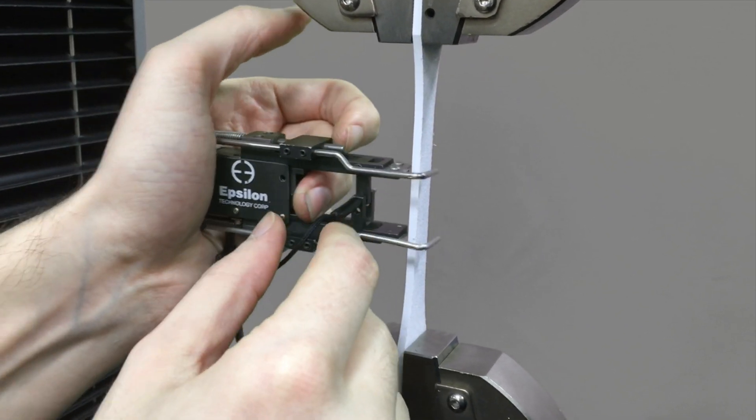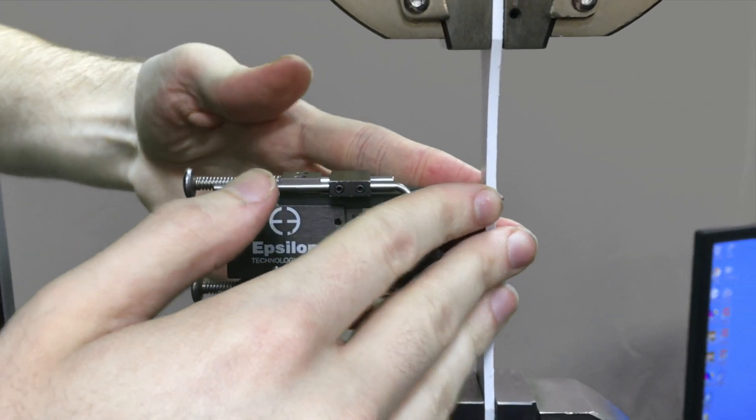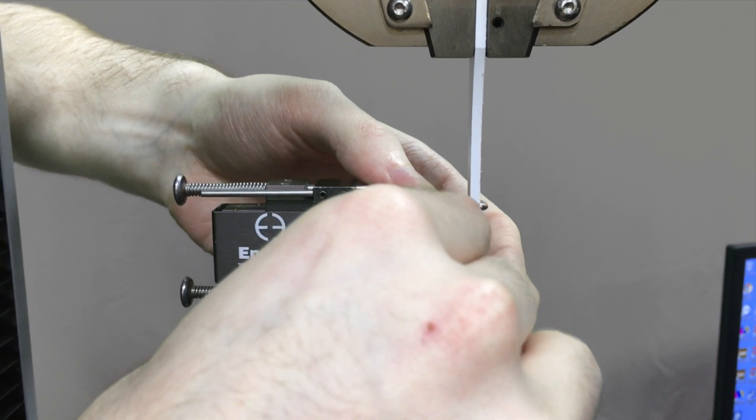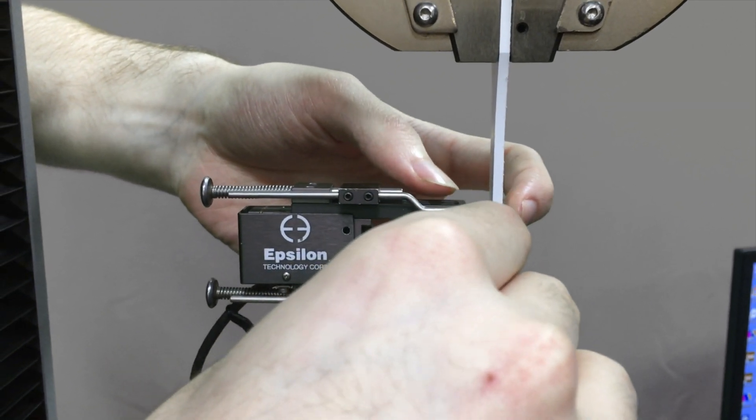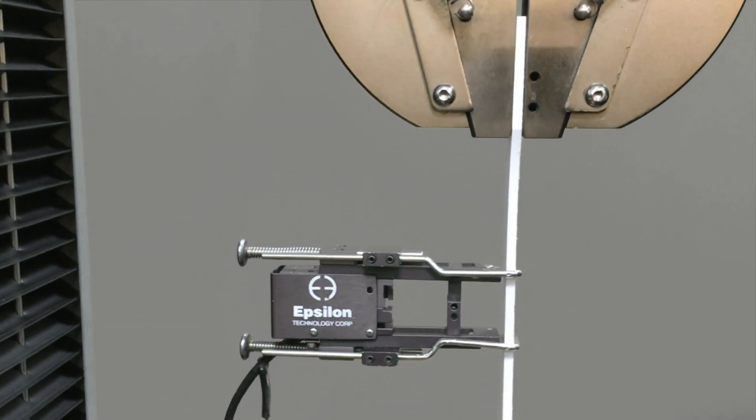Place it on. Again, make sure it's straight. Then remove the pin. This ensures that your extensometer is at its gauge length.